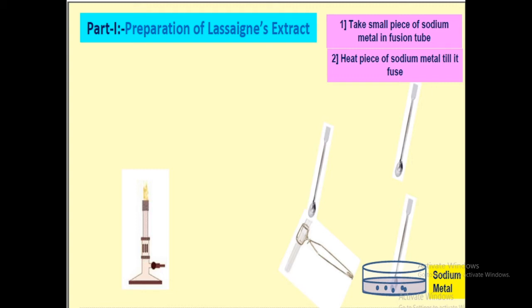We have to heat the sodium in that tube until it fuses. Therefore, it is known as sodium fusion tube. In the first step, when the sodium is fused in that sodium fusion tube, then in the second part, we have to pull that tube.